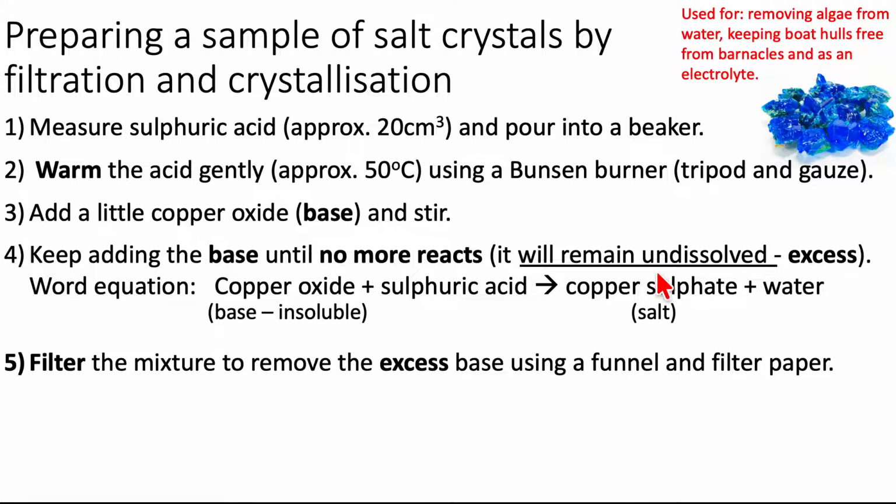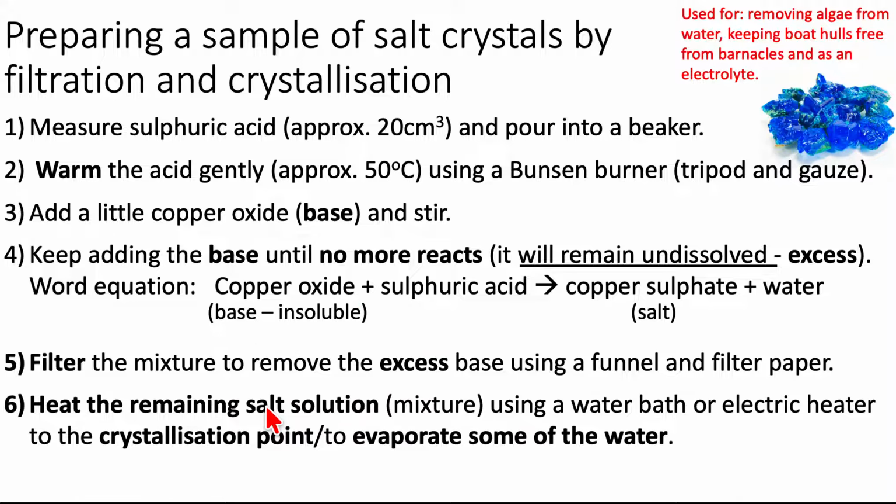because at this stage I've got copper sulfate solution, i.e. copper sulfate, water, and my excess copper oxide, so I need to get rid of this, so I filter it out. The next job is to heat the solution using the likes of a water bath or an electric heater to what's called the crystallization point, or we can just say to evaporate some of the water.